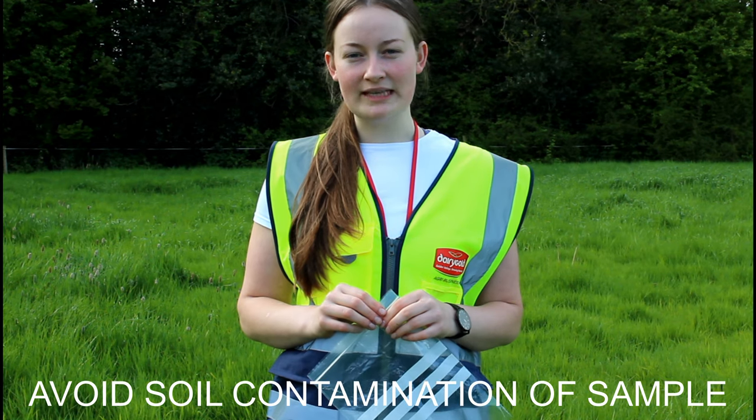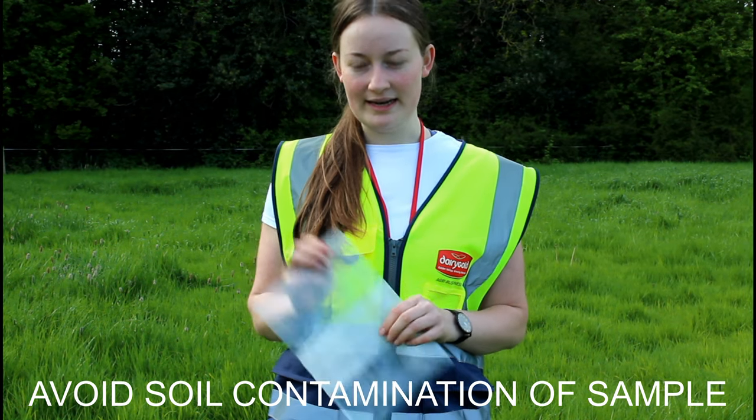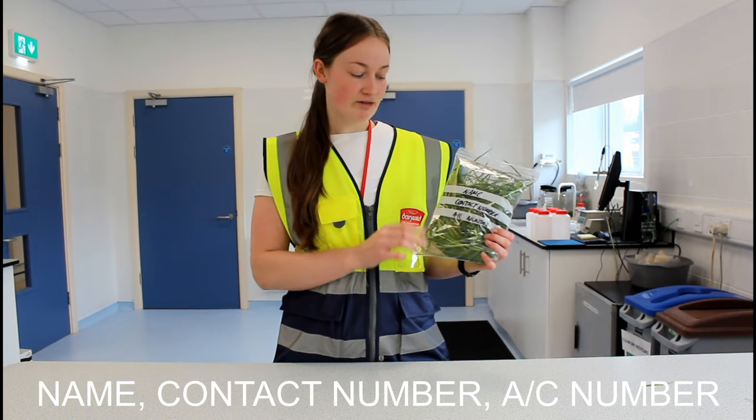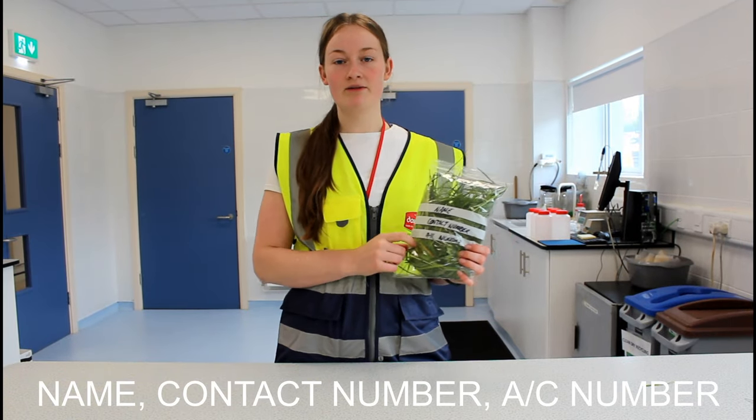Avoid soil contamination of the sample and place your sample in an airtight bag. This is what your sample should look like in the bag. On the bag you should have your name, contact number, and account number.